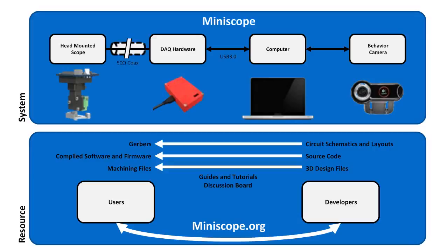We've also, as I will go into later, tried to make this as open source as possible. We've generated a website called miniscope.org, and on this website, users and developers can interact. All the parts lists and designs and circuit board layouts, all the software is provided there, and people can go there and develop their own microscopes and even make improvements to the current microscopes. There's a lot of interaction. And so I'll go into this a little bit later, but I think this is a critical thing for the development of this open source resource.